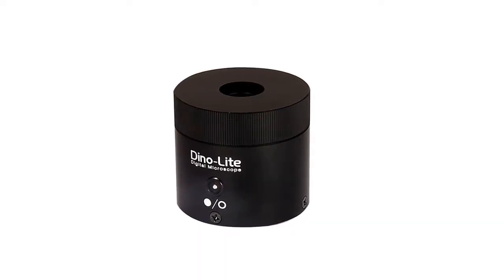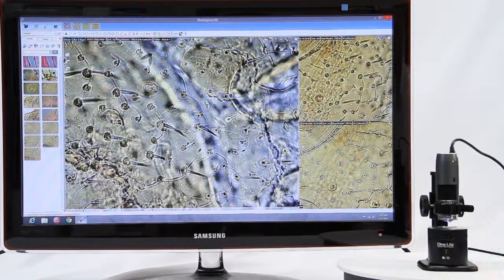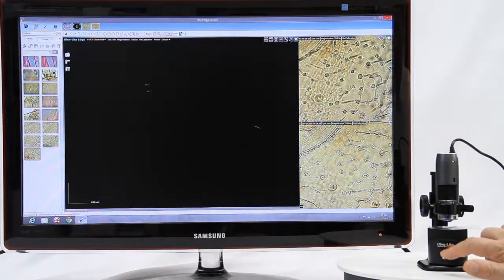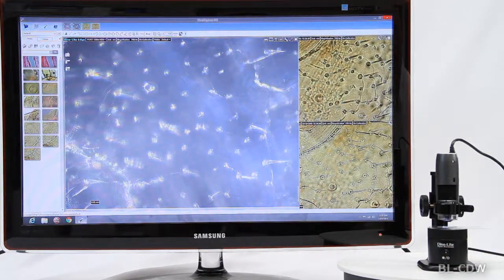Introducing the Dynolite BLCDW Backlight Illuminator, which provides alternative ways to enhance the contrast of a specimen with bright field and dark field modes.